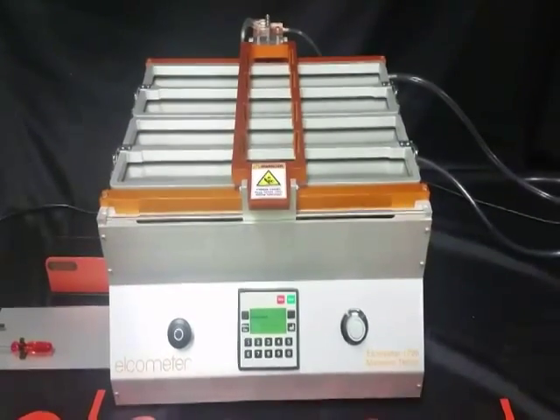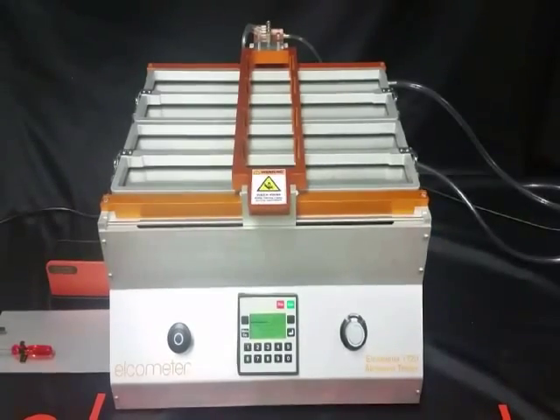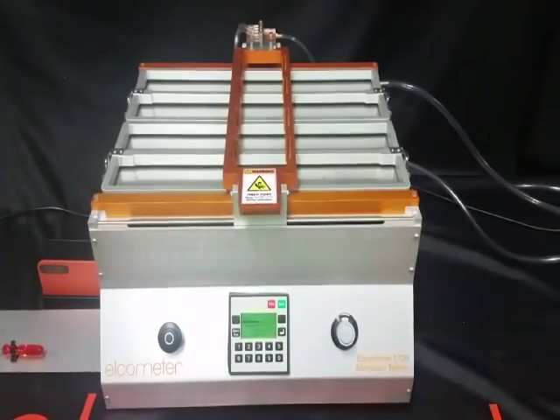Today we are demonstrating the Elcometer 1720 Abrasion and Washability Tester. The 1720 tests for washability, brushability, and resistance of materials.